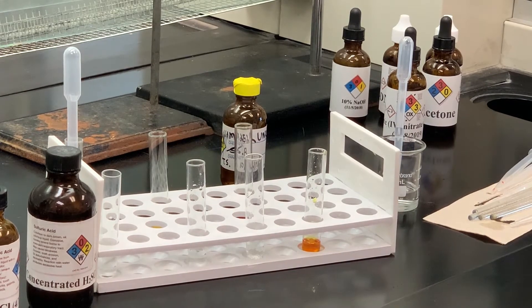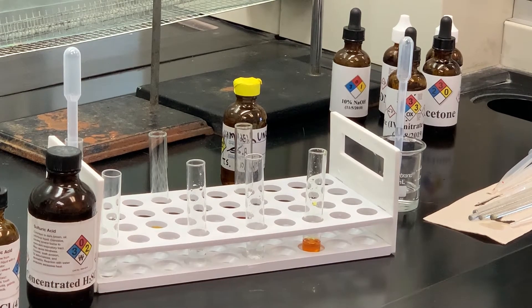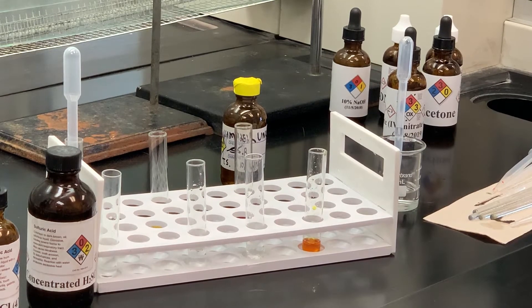Knowing the solubility can greatly reduce the number of chemical tests you do — you just don't want to start grabbing every bottle and testing. If it is soluble in sulfuric acid, it could be a higher molecular weight alcohol, a higher molecular weight aldehyde, a ketone, an ester, a high molecular weight carboxylic acid, amide, or high molecular weight amine. But since earlier we said we're not using amides or esters, we can rule those out. The chemical tests we use will narrow down which class of compound we have.